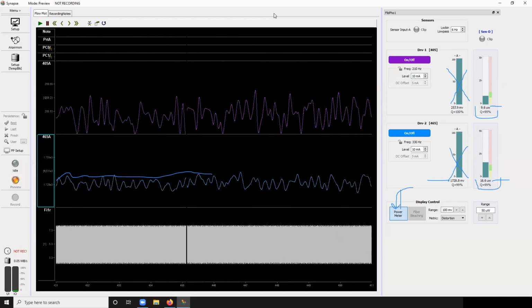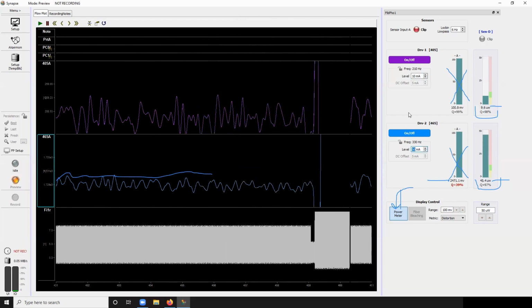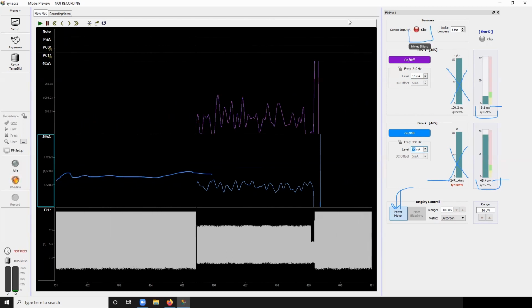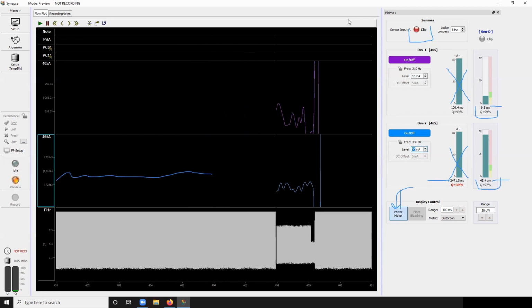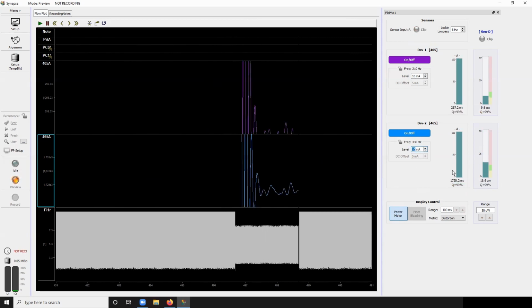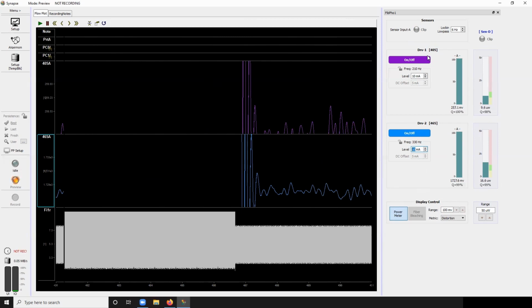So again, we just so happen to be lucky that we're not clipping, but if I were to bump this up, for example, to like 50, you'll see here we start to clip. We're saturating the photo sensor. You'll see this quality factor drop. So some people look at that and say, oh, bad, but no, because we're in the PM1, so we don't care about the PS1 bar graph right now. In any case, let me go back down to 10.